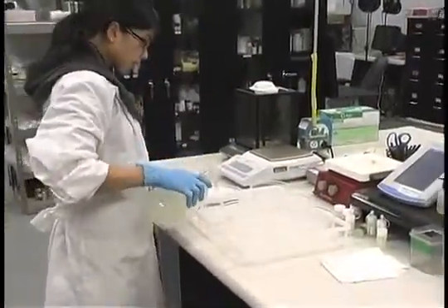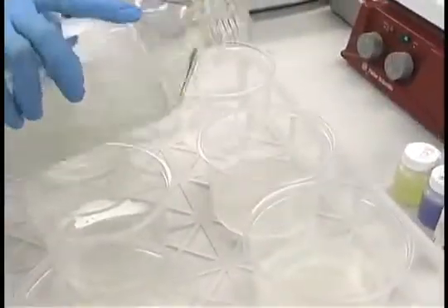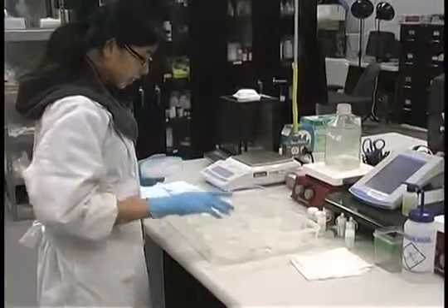If you are using autoclavable culture vessels such as glass jars, phytocons, or magenta boxes, dispense the medium into the culture vessels prior to autoclaving.